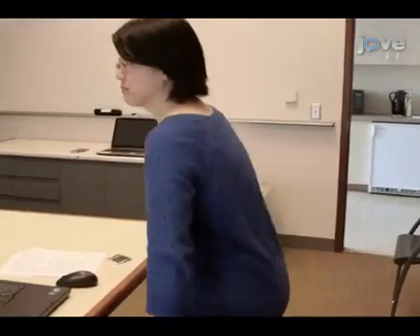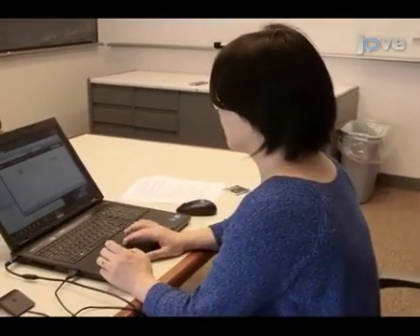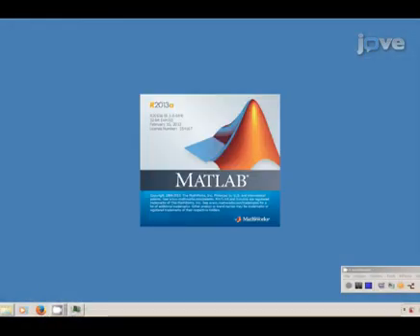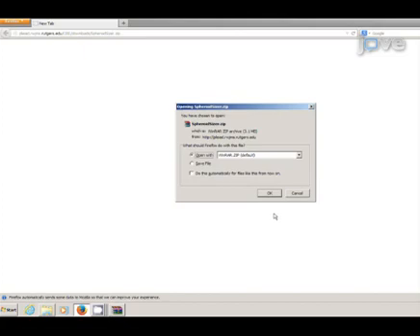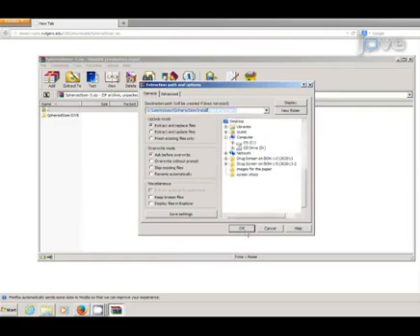Spheroid Sizer requires MATLAB with the signal processing and image processing toolboxes. An optional toolbox to use is parallel processing. Download Spheroid Sizer from the Rutgers server and unzip it to an installation directory, which will be needed in subsequent steps.